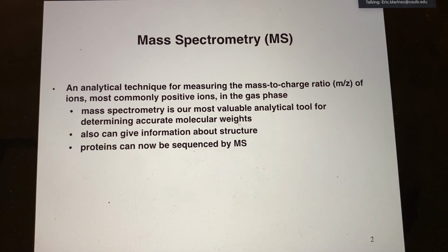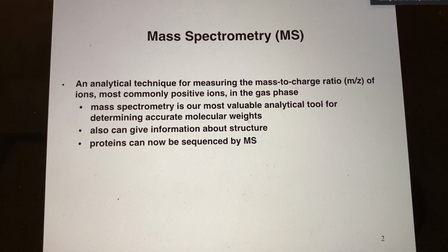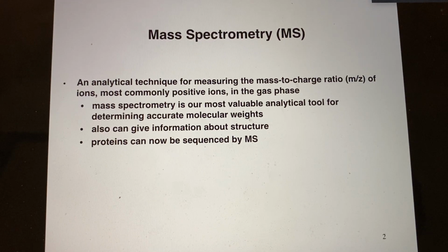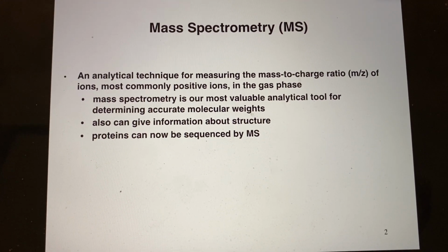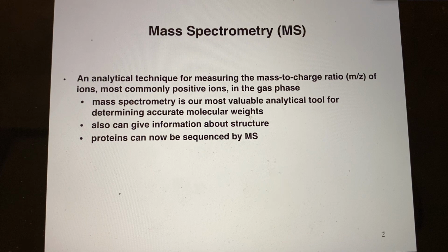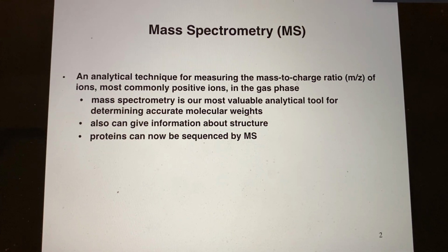The reason to teach mass spectrometry is that it's one of the more valuable tools that helps us determine molecular weights. Okay? So that's the easy part of all this. But the interesting part is that we often get information about structure.